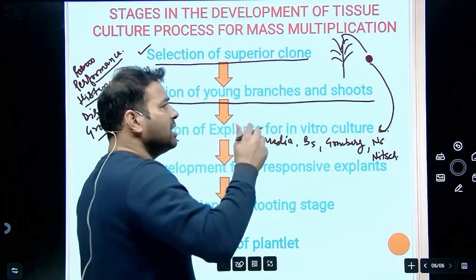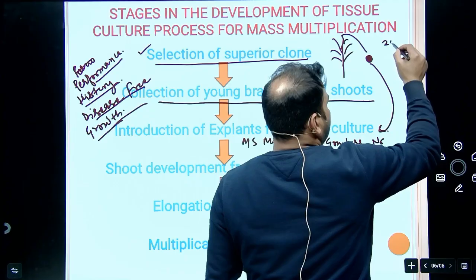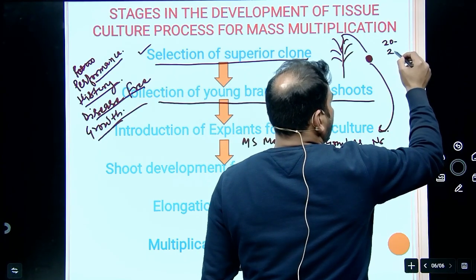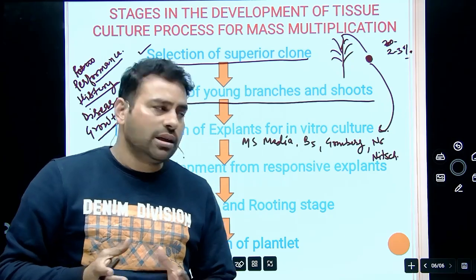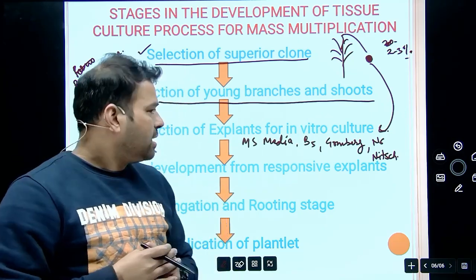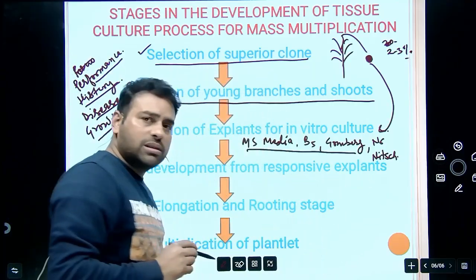The amount of carbon source is generally in the range of 2% to 3%. But in the case of pollens, they need more energy, so the amount of the carbon source will be 8 to 10%. So these media basically we are using in plant tissue culture experiments.